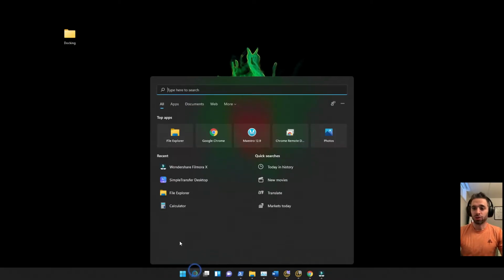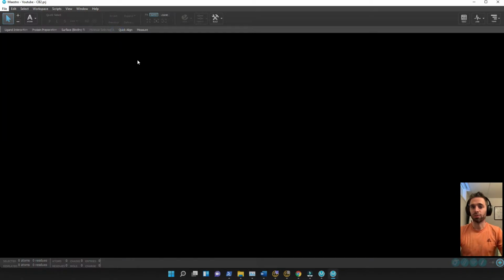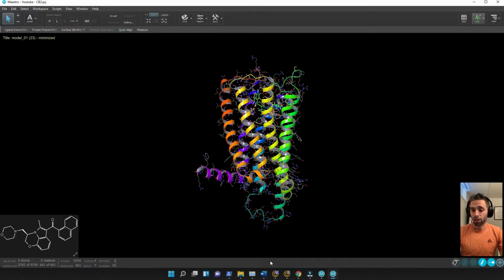Okay, let's open up a Schrodinger CB2 project. Now what we need to do is locate the files that those QikProp jobs have finished.